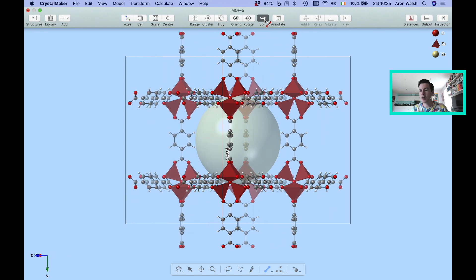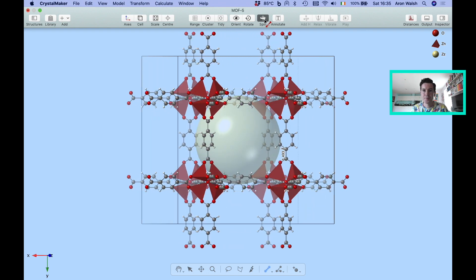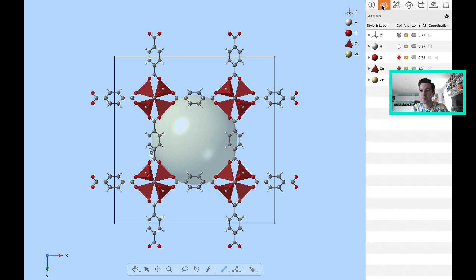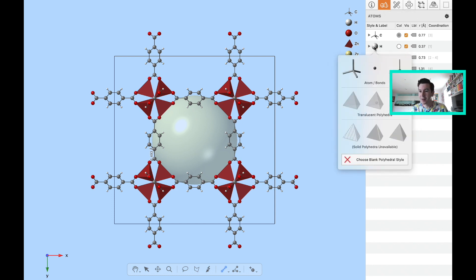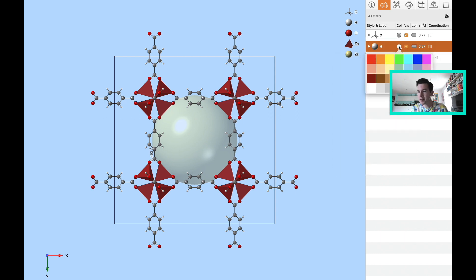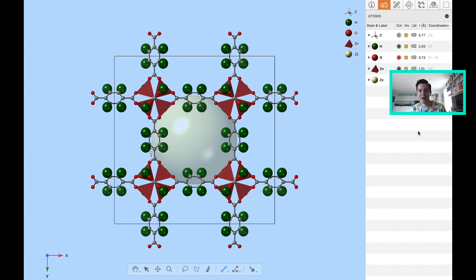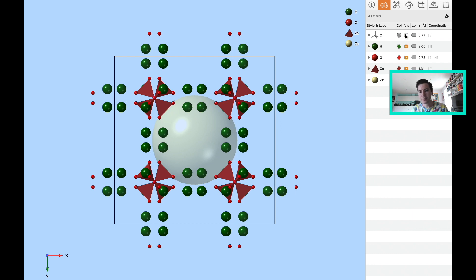Spinning gives you a good idea of the three-dimensional nature of the structure. In the inspector is where you can control all of the visualization settings. It gives a little summary of the chemical composition and where the structure came from. The second tab shows all of the atoms present in the system — I can change the color and the radius. For example, if I want to change hydrogens to be green and make them really large at two angstroms, suddenly you can see all the hydrogens in the crystal. I can also make all the carbons invisible. So if you have a very complex structure, you can use these visualization tricks to simplify and help understand it.